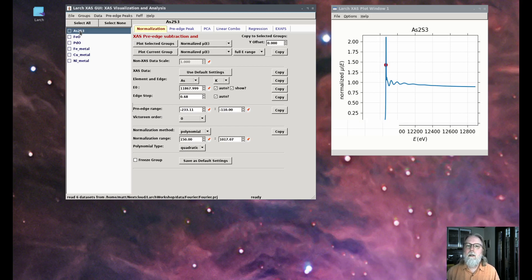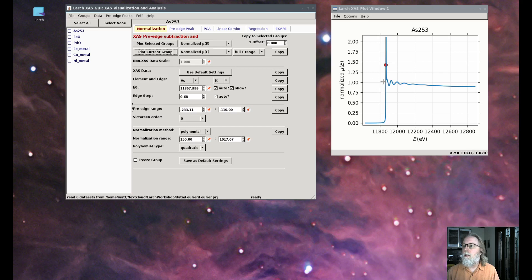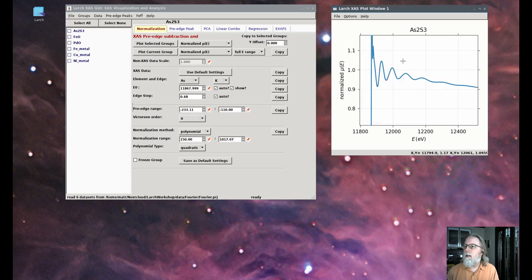Here's some arsenic K-edge data on an arsenic sulfide. Here's the XAFS — the normalized mu. If we zoom in on this, you can see that there's a nice oscillatory behavior to the XAFS. In fact, for this data set, there's really only one frequency, which is why we're going to start with that.